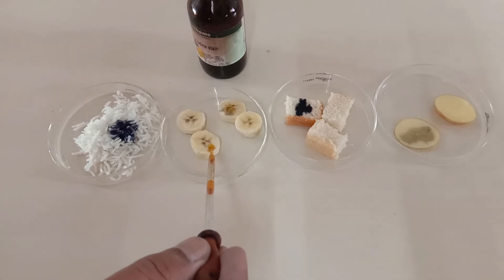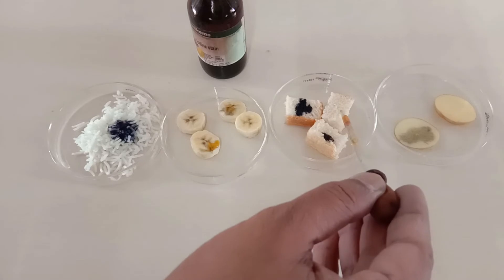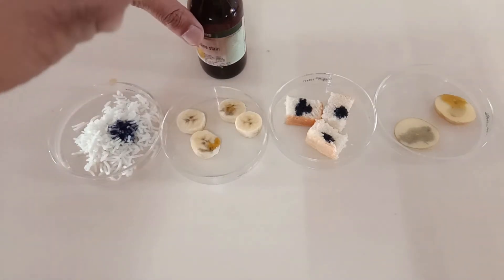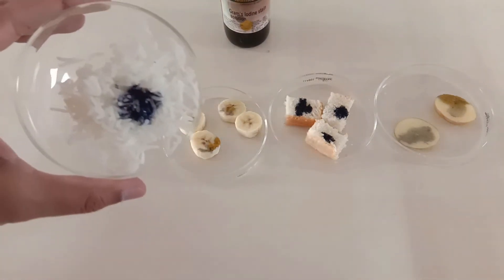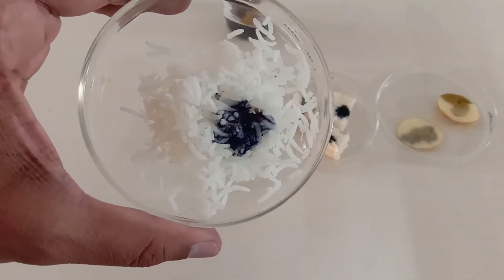Some food items may take some time to change the color. You can see the blue-black color shows the presence of starch in the rice and the other food items also.